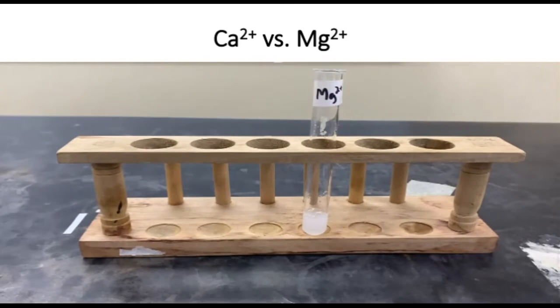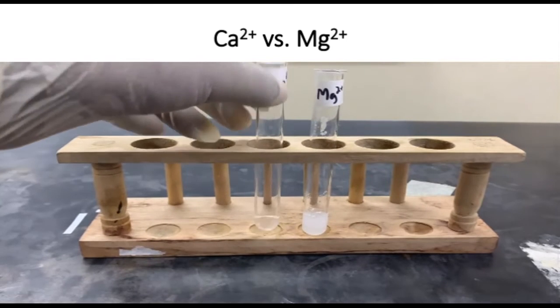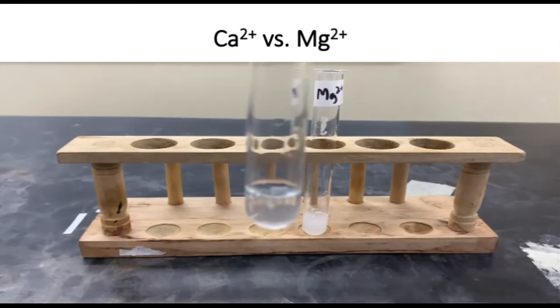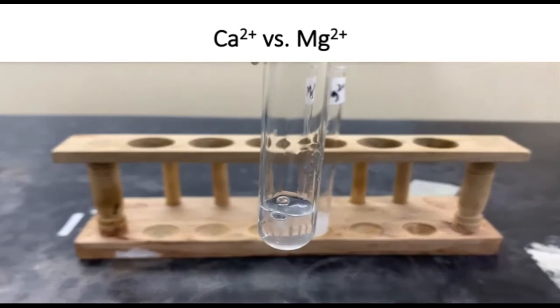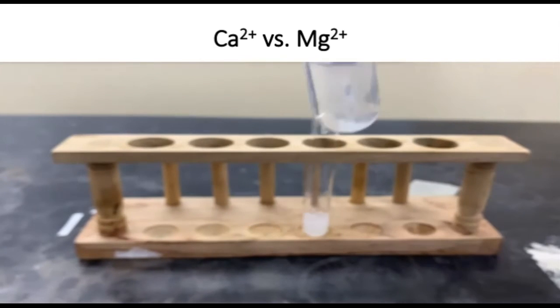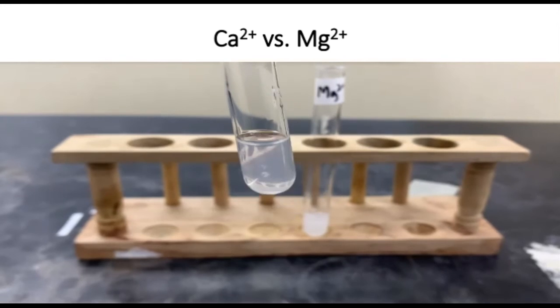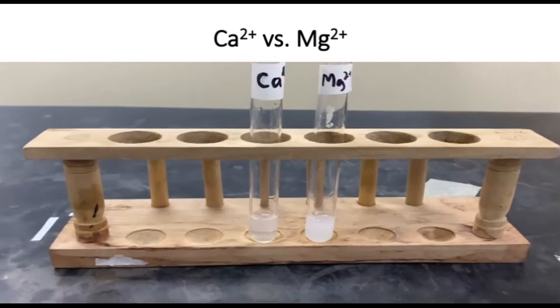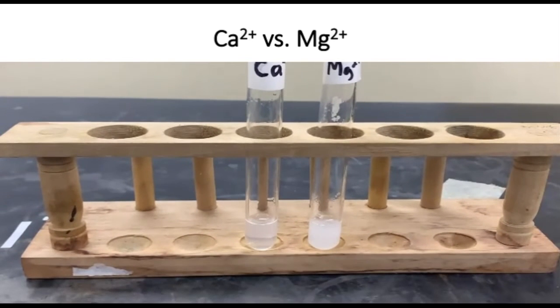We'll do the same thing for calcium ions. So we're going to add a few drops of aqueous ammonia, and we are not seeing any precipitate being formed. So that's what we use to distinguish between the two. We don't get any precipitate with our aqueous ammonia.